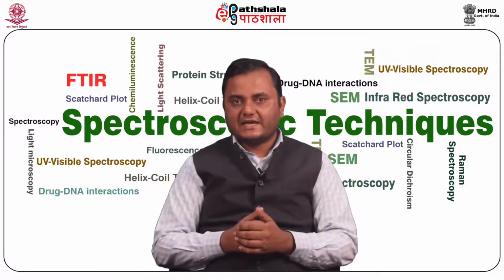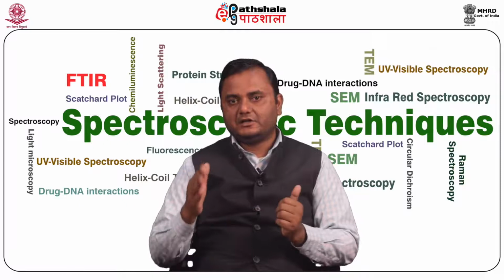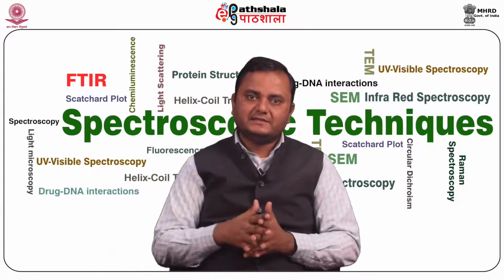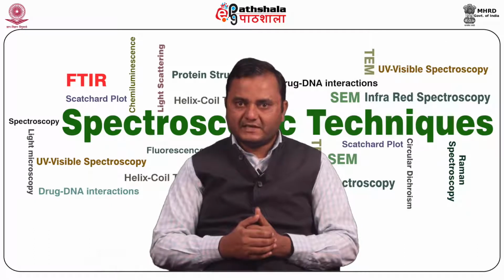Some FTIR scanning parameters: for two widely spaced lines, taking data over a short path difference is sufficient to resolve these lines. For two close lines, the interferogram must be measured over a longer path difference to get a satisfactory spectrum.